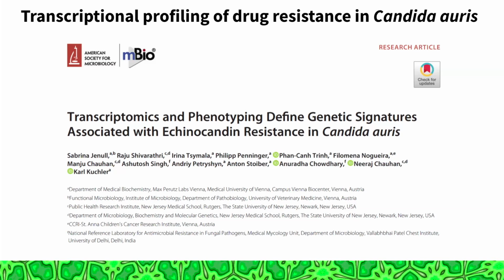So essentially, what will be happening behind the scenes is that we will allow people to run genome-wide alignments. There are some interesting performance and usability questions here. For smaller genomes, like yeast, for example, or Plasmodium, or some insects, where there are plenty of not so large genomes, you can probably run alignments yourself. It's still going to take some time, but it's a finite time.